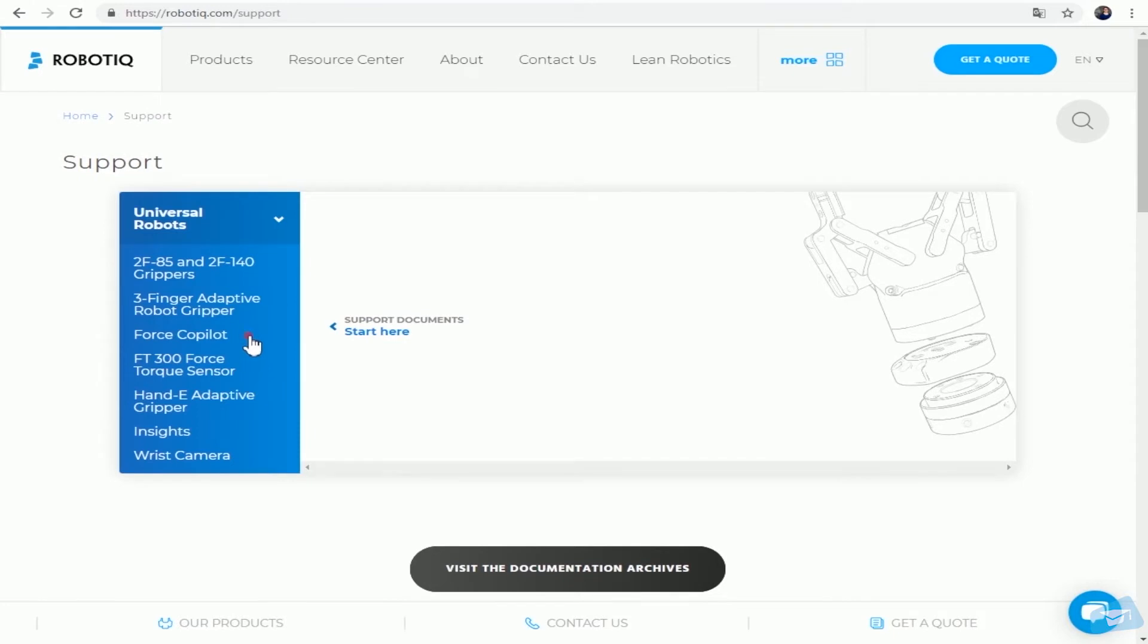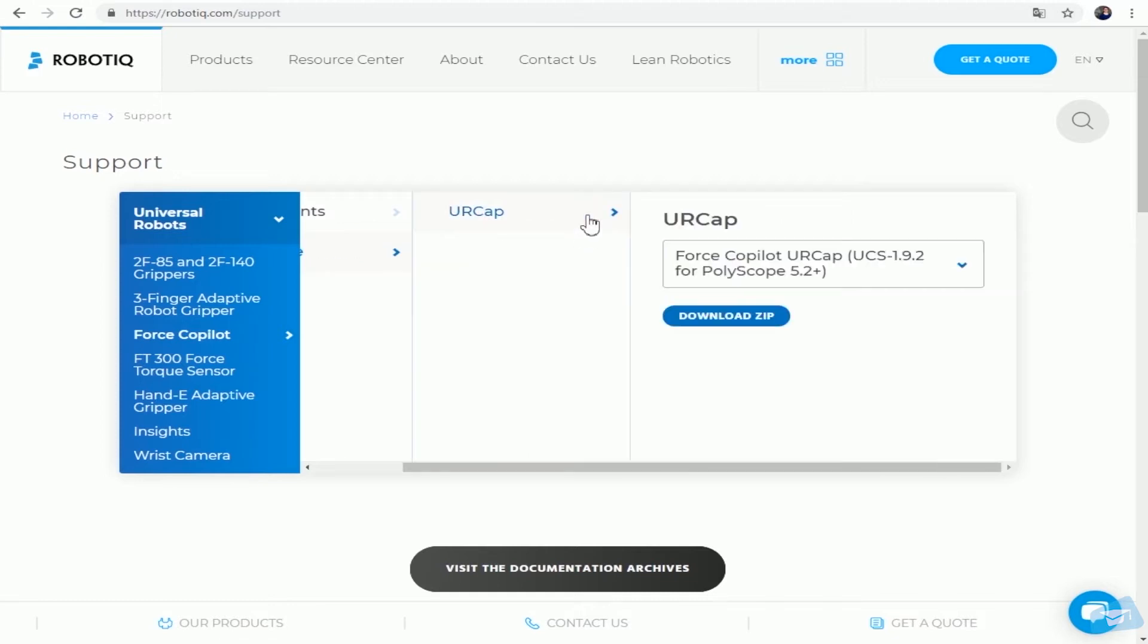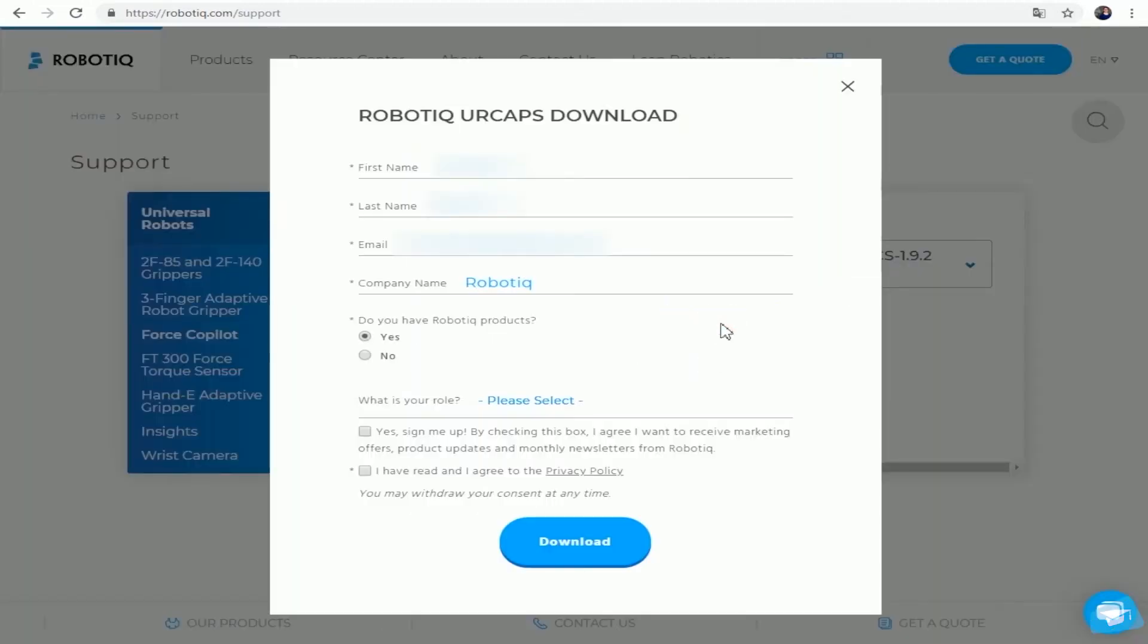Select your product, then Software, then UR Cap, and Download Zip. Fill in the Robotiq UR Caps download form and then press the Download button.